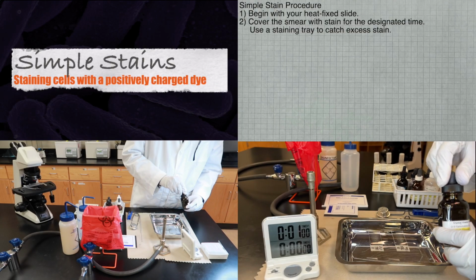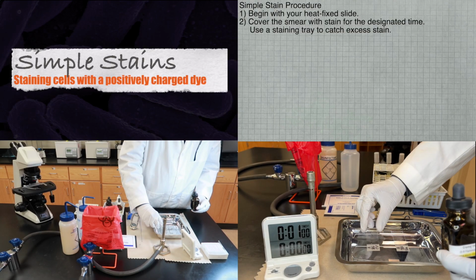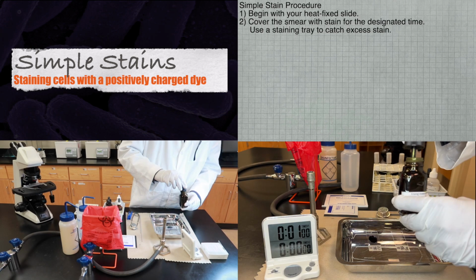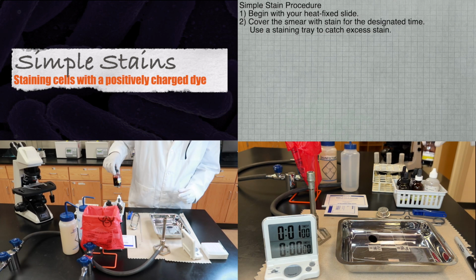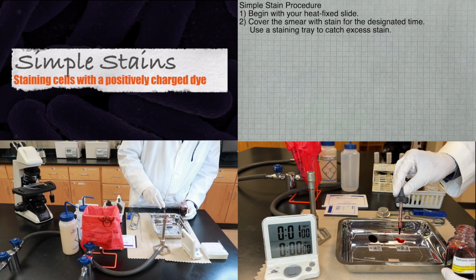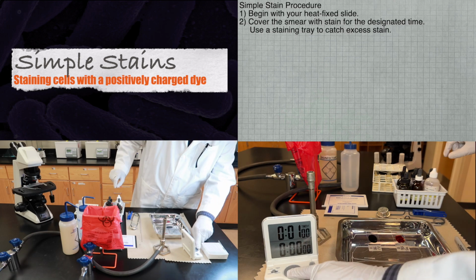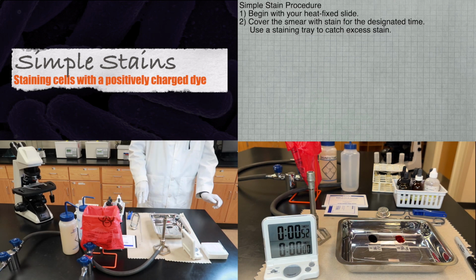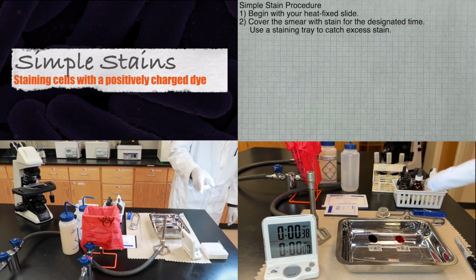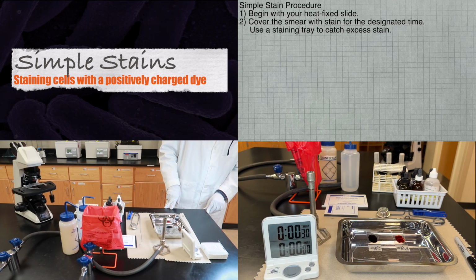Now that you have prepared your bacterial smear and heat fixed your slide, we're going to describe the simple staining procedure. First, cover your smear with the appropriate stain for the designated time. Please note the timing is critical. Follow the exact time listed in your lab procedure handout. Make sure you're using a staining tray to catch the excess stain.